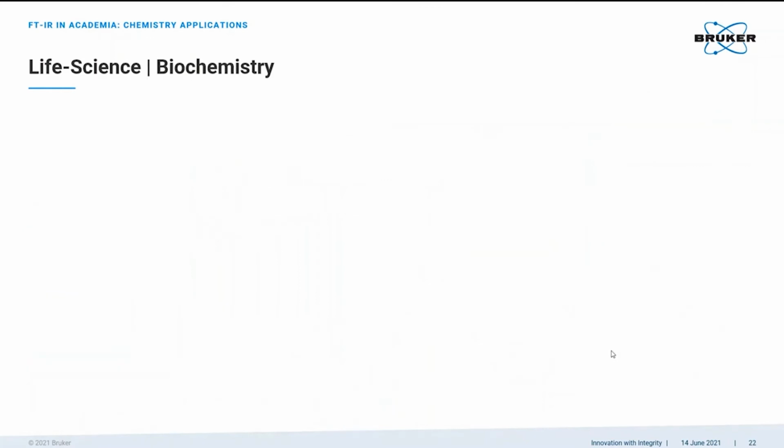I think that going from synthetic polymers to biopolymers like proteins is a quite nice transition. So as soon as we enter biochemistry, many different infrared applications come to mind. In this case, I first want to talk about protein analysis.